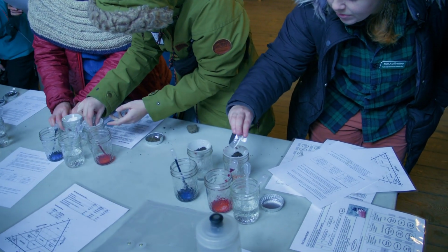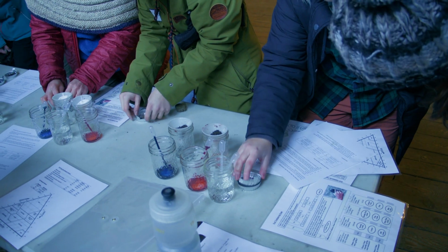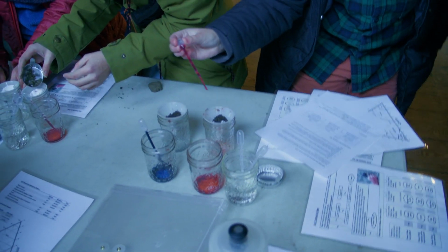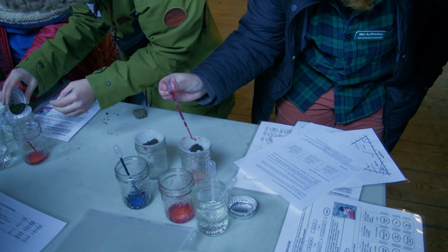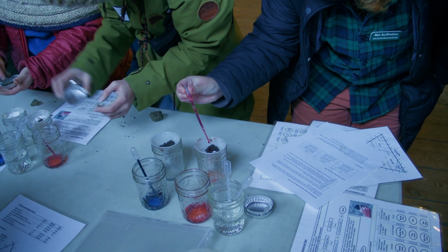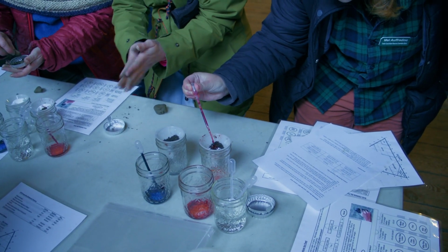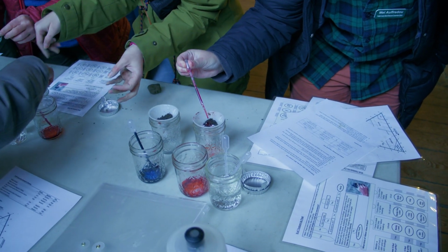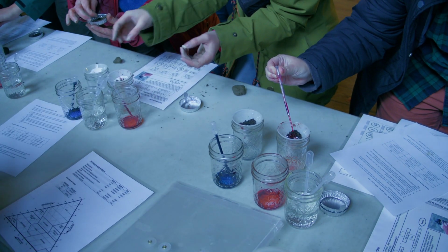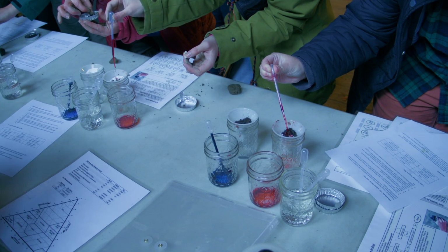Milliliter per? Yeah, exactly. Okay. So 20 drops of red in one and 20 drops of blue in the other. Like a full squirt. Yeah, just kind of in the same spot like you're doing. That's perfect. Great. So 20 and 20. Yep, and you can always make a little indent. I can put it right in there, until the water starts coming out.